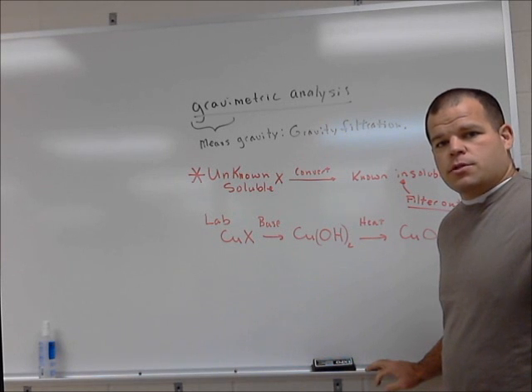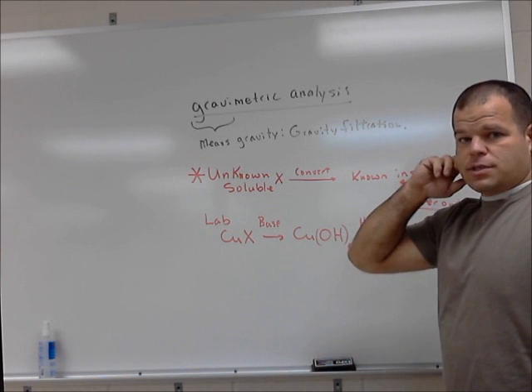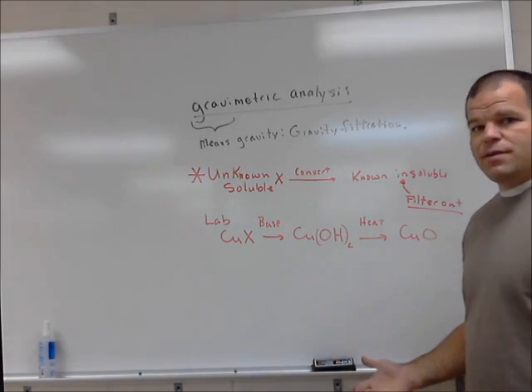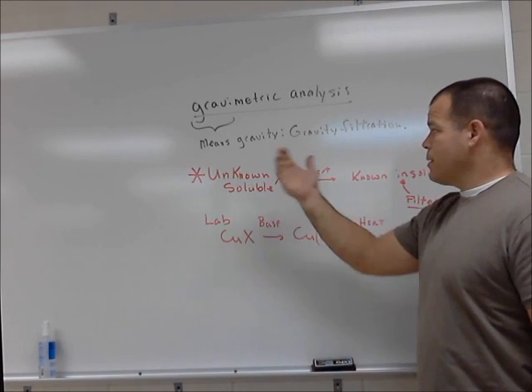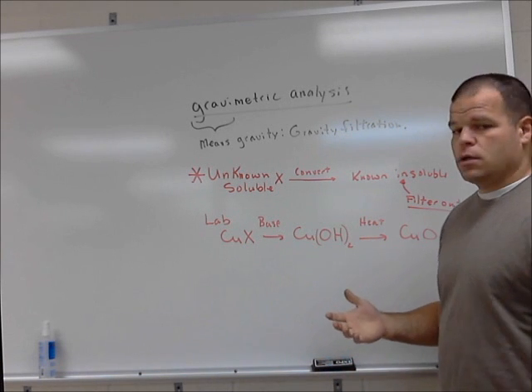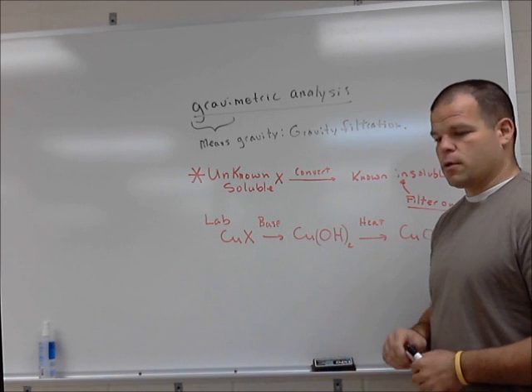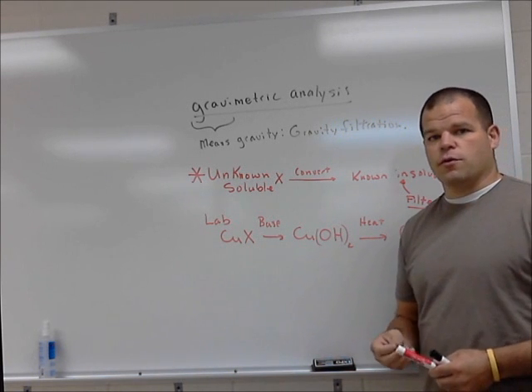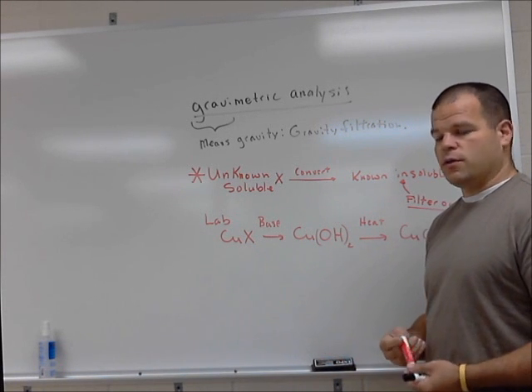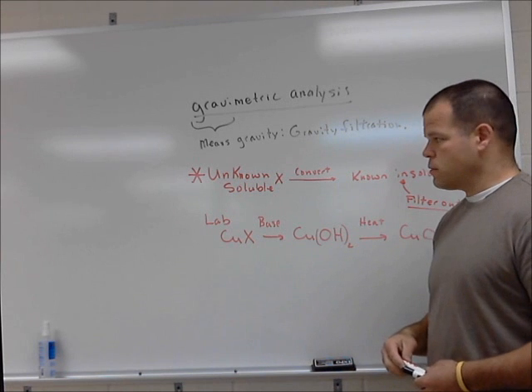My name is Mr. Schweitzer, and I'm going to give you a little preview into our gravimetric analysis lab. Now, gravimetric analysis, the word gravimetric means gravity. There's a filtration here where we used to always filter things via gravity, just in a funnel with a filter paper. We're going to use a different method for funneling that will go a little quicker, but the name still holds where we're going to be filtering, and that gravic means gravity filtration.